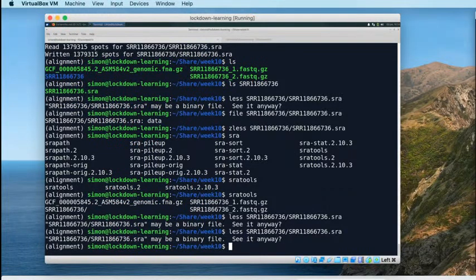If that metadata is wrong for whatever reason, then you can end up with unexpected results. I have seen an example of exactly that: a 50 base pair paired end experiment stored on the SRA, where the metadata was wrong, and when you used fastq-dump to split it into its paired end reads, you ended up with one 70 base pair read and one 30 base pair read, because the metadata was inaccurate and so the read wasn't getting split correctly. What I'm going to assume for this experiment, and I've not had a chance to check, is that that hasn't happened. We've got decent data in our FastQ files.